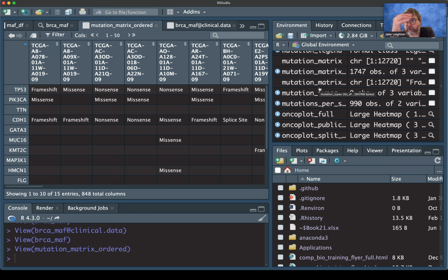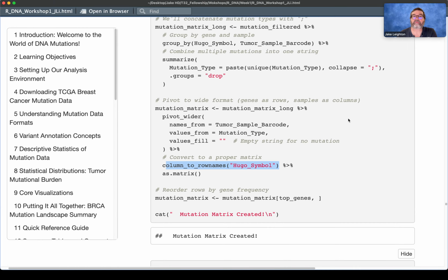I like how everything's reversed. How do you fix things when they're reversed? You can do all the clustering, the analysis of the complex heat map, and you can also do your oncoplot, all from the same matrix. So this is a really good matrix, and sometimes this is the last matrix you get, or the only matrix you get. So you could actually start here too. We'll talk more about that later, in a different workshop.